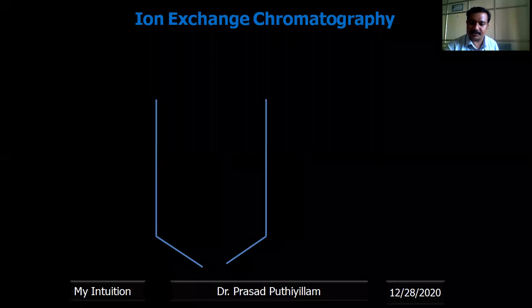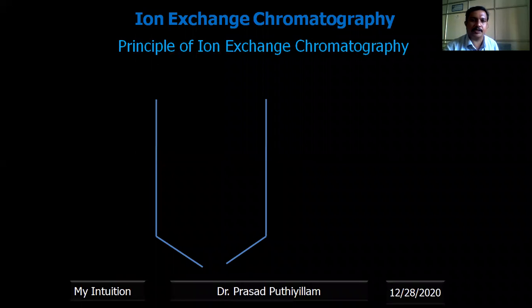In the previous class, I explained the basics of ion exchange chromatography, and this particular class is for the principle of ion exchange chromatography.